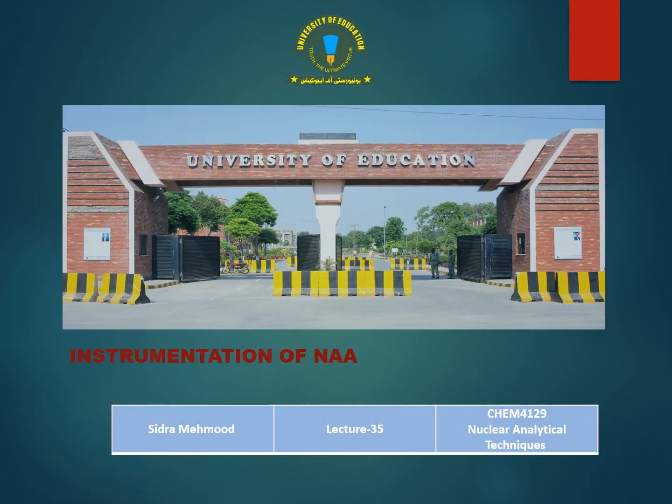Bismillahirrahmanirrahim. I am Sidra Mehmood and this is lecture number 35 of Nuclear Analytical Techniques. Today our topic is Instrumentation of Neutron Activation Analysis.